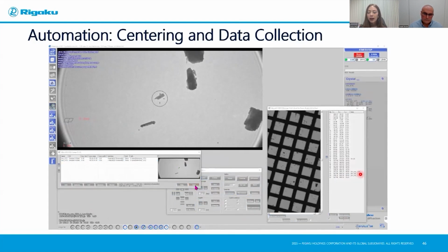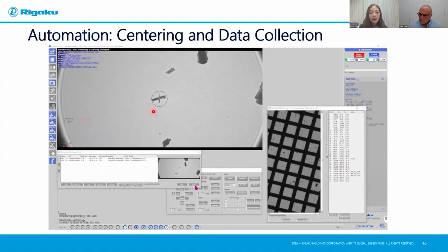And this is a point where I have sped up this process just for the purposes of viewing this. So what we're going to see is the actual automated eccentric height adjustment. So what's happening here in a sped up way is we have this crosshair in the middle representing the center of our aperture. And we have another crosshair that is basically keeping track of the crystal. As we tilt the crystal, we are bringing those 2 crosshairs together by adjusting the eccentric height.